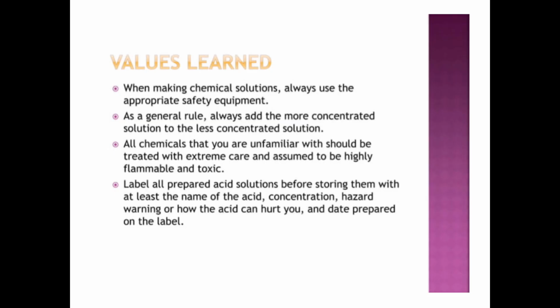The next one is that all chemicals that you are unfamiliar with should be treated with extreme care and assumed to be highly flammable and toxic, so that you'll be able to prepare for them very well.